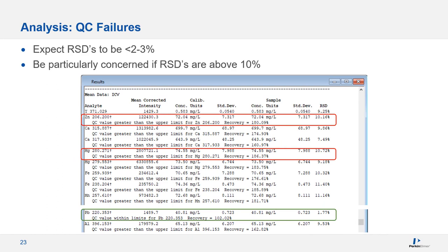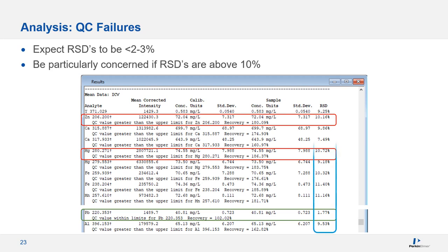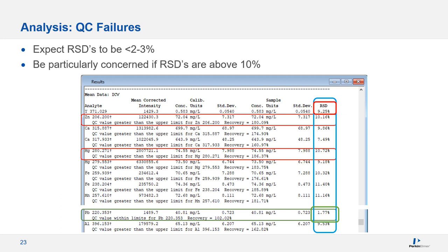Most of the time, you'll run three replicates of each sample and look at the average of those results. But it's also helpful to see how those replicates compare to each other. Precision within sample replicates is a good troubleshooting tool. It confirms that the result you've obtained is repeatable and stable in the short term. Let's take a look at the RSDs for our example data. Typical precisions are anything less than 2-3%. As a ballpark figure, poor precision is greater than around 10% RSDs. So with that in mind, the failing elements have high RSDs, but again, lead is within a normal range. Poor precision can indicate your pump tubing needs to be replaced, or the tension on it isn't correct.